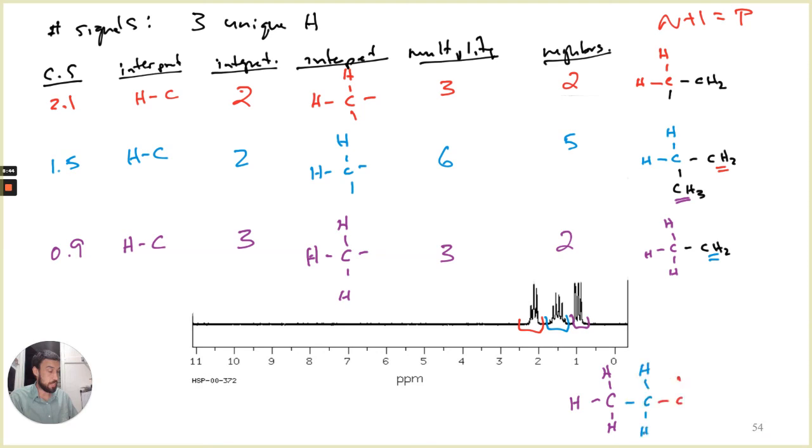And then that red one. Problem is, I get that hanging spot. And what connects there? Since I don't have any other evidence, there could be all sorts of things that could connect in on that spot. That's where I would have to rely on other spectra, or if it was a multiple choice, the answer choices themselves to help me whittle that down.